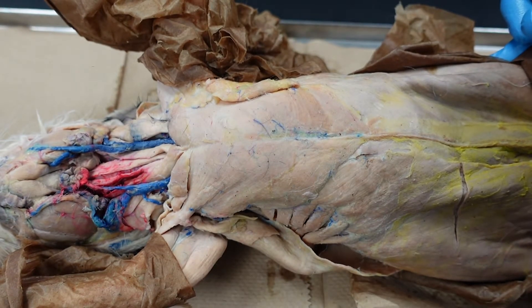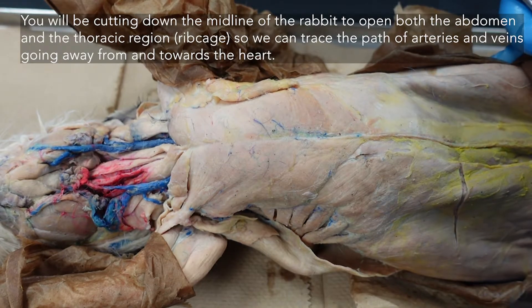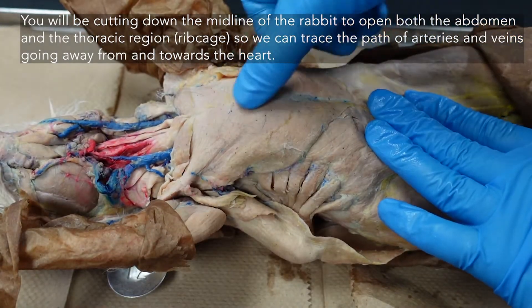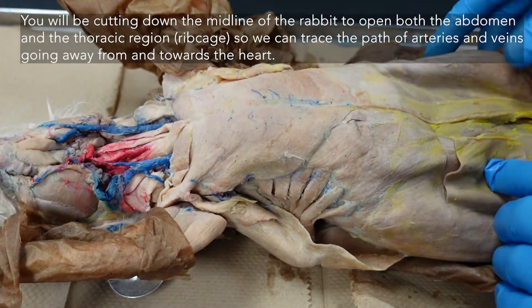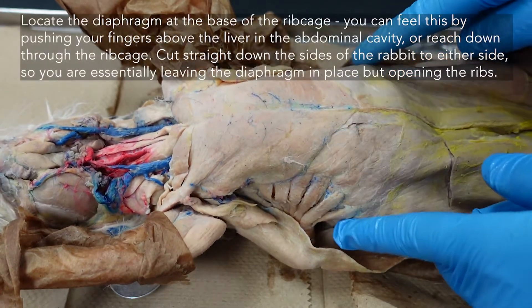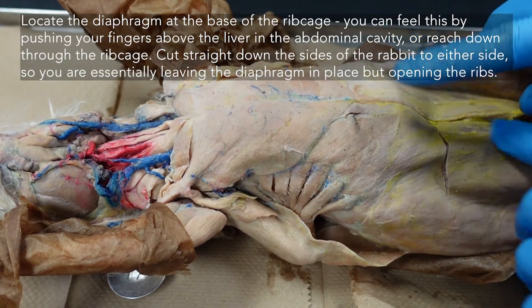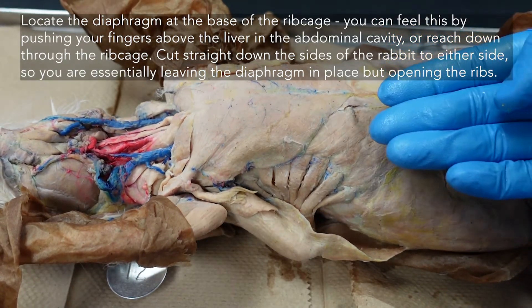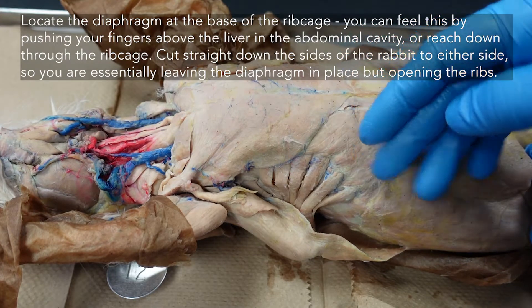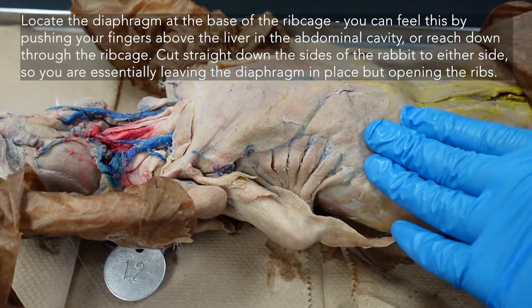Hello everyone, we are opening up the ribcage of the rabbit today to start to look at the circulatory system. To locate the areas where to cut, we found it easiest to actually feel. We want to keep the diaphragm intact — the muscle that helps with breathing — so we want to find it by going in from the abdominal cavity, finding that area, and making sure to leave it intact as we're cutting.